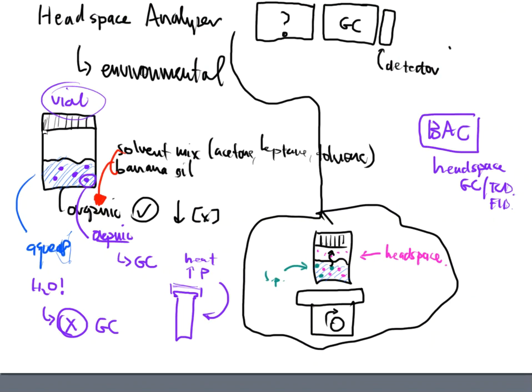So finally, some things that I want to leave you with in this video. There are others, of course, that complement what you've just heard from me. But the headspace system. I've talked about this headspace attachment, but I want you to understand that this can also be done manually. It is a much more labor-intensive process. You're going to have to be really particular with the times, really particular with the temperatures.